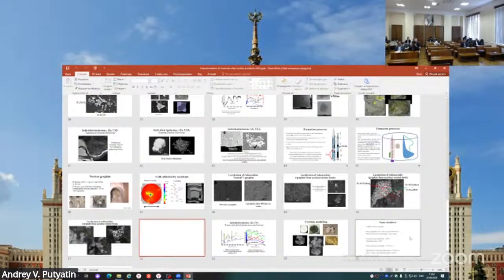For this analysis of the Chernobyl lava or other examples, this equipment, is it specialized equipment with shielding from the radiation, some special detectors? I don't know. Of course, you should ideally use nuclearized devices, first to protect yourself, second to minimize damage to the detector, but also you can try to minimize the size of the sample, and then you can partly avoid all these problems. But of course, usually people work with nuclearized equipment.